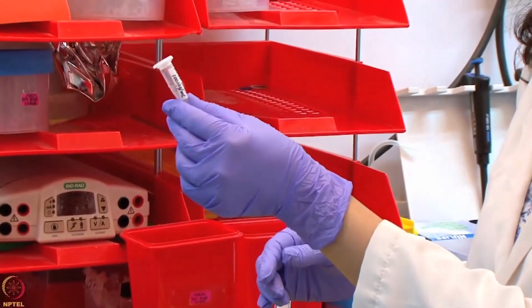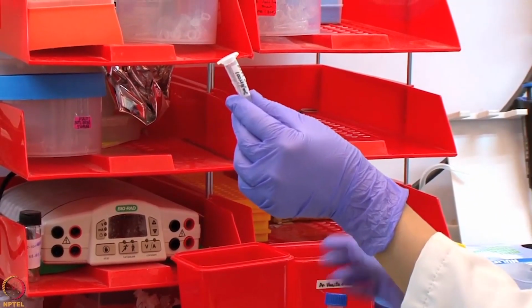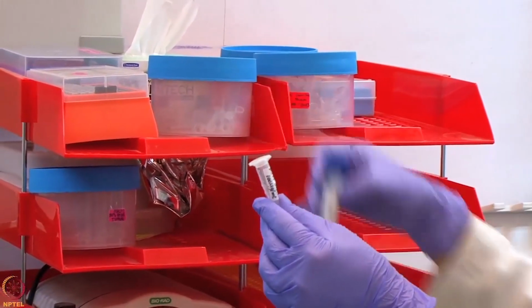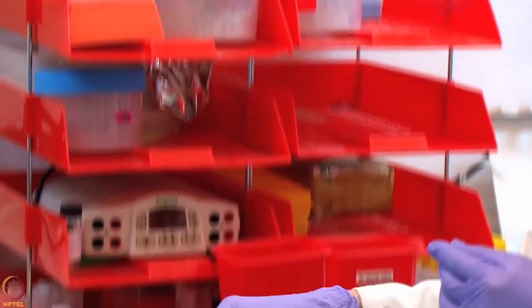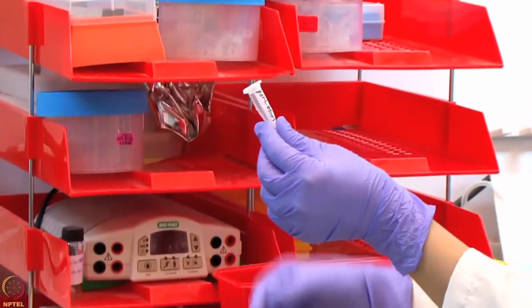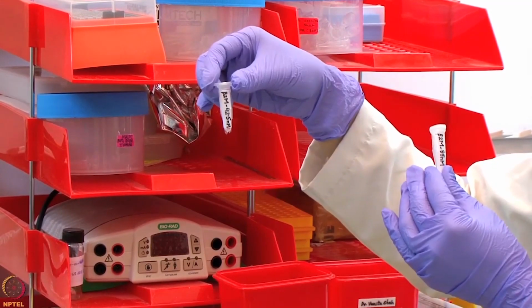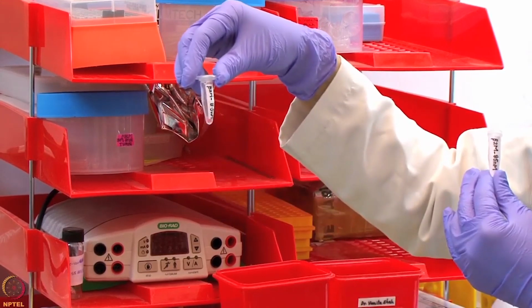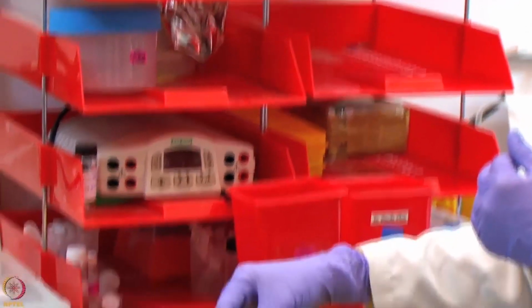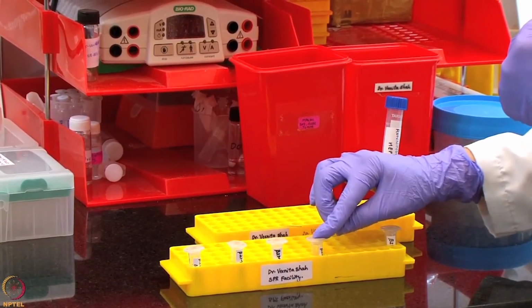We will dilute the stock solution of protein, that is 100 microgram per ml, in the running buffer HBS-EP Plus to prepare 100 microliter of 3 different concentrations, that is 85 nanomolar, 42.5 nanomolar and 8.5 nanomolar, which are referred to as high, medium and low concentrations in the experiment.